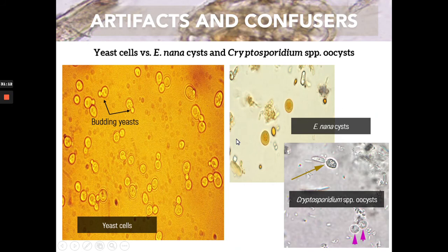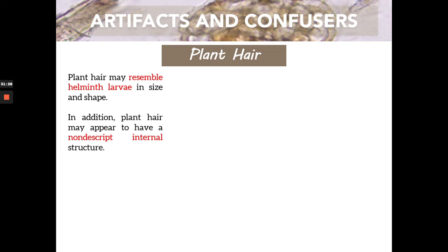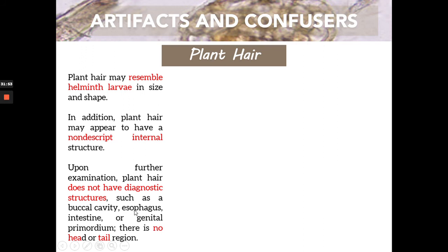Plant hair may resemble helminth larvae in shape. However, plant hair has a non-descript internal structure — it is not definite. Upon further examination, they do not have diagnostic structures like the buccal region, cavity, esophagus, genital primordium, or head and tail regions.